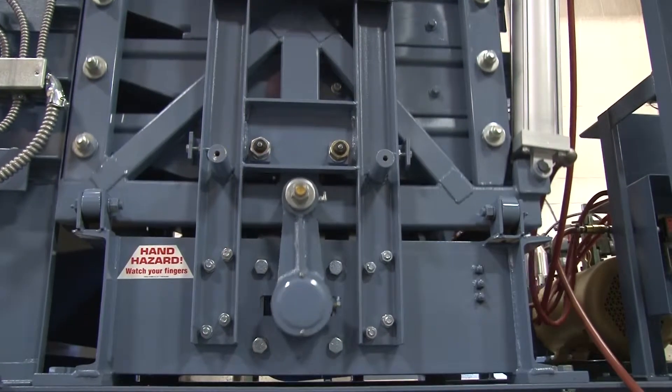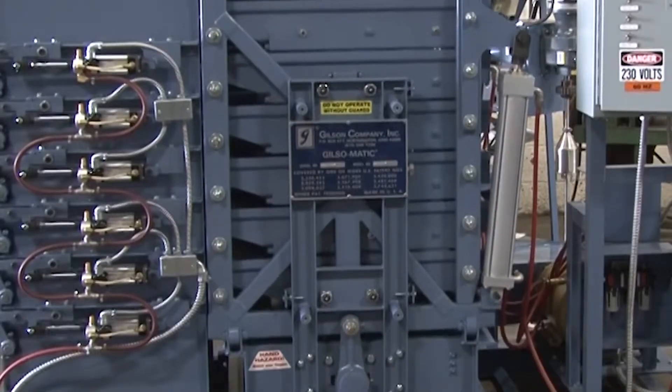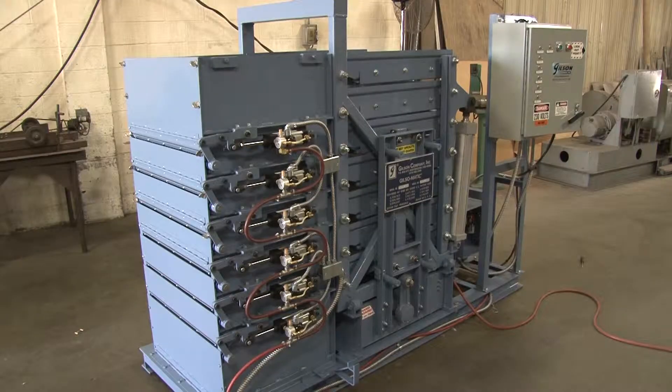The mechanism of the Screening Assembly is internally counterbalanced for smooth operation and to minimize transfer of vibration.